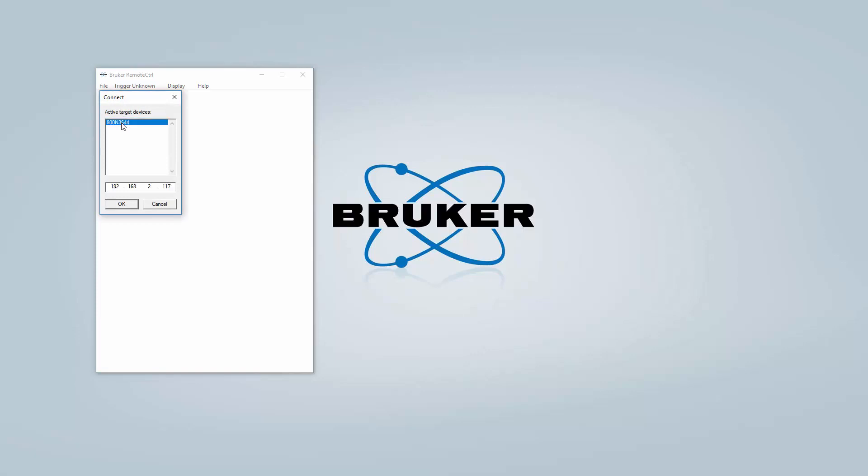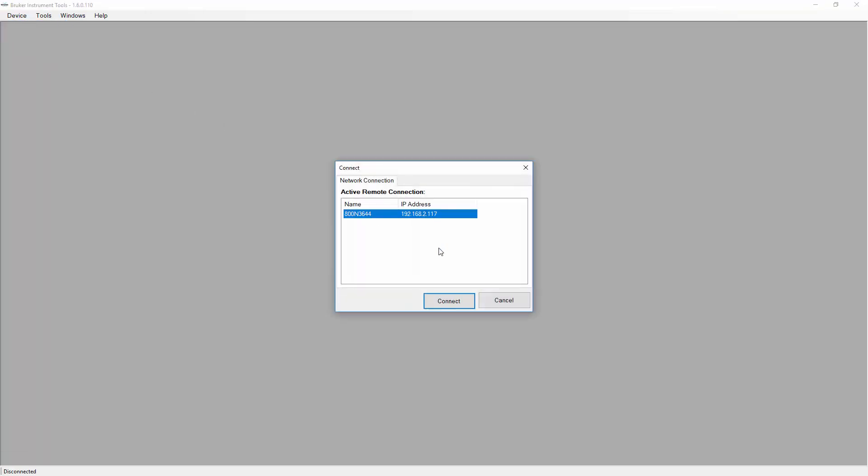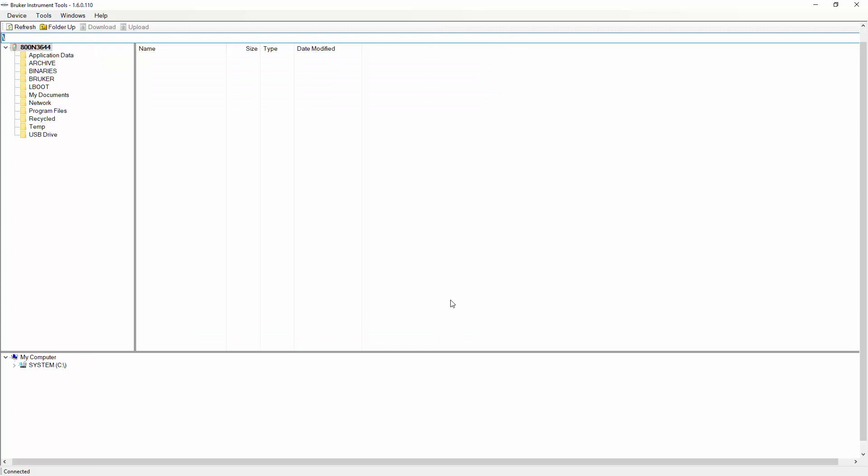If you now connect to your unit again, the new IP address will appear. This also is valid for Bruker Instrument Tools and RTACs.